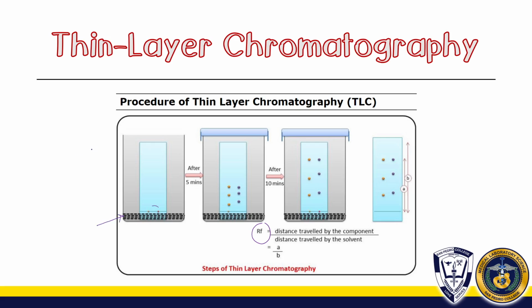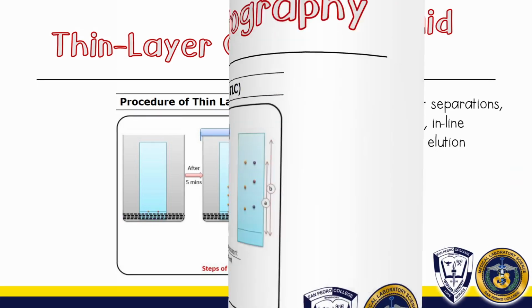You place your analyte here, and after some time, through capillary action, separation of the components occurs. That is your thin layer chromatography.